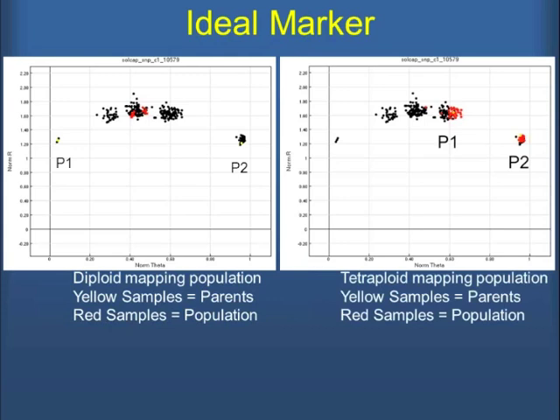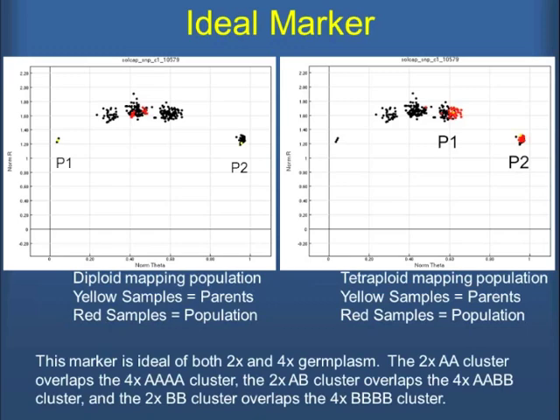So looking at our data here, Candy feels that these are some ideal SNP markers in terms of the way that they're sorting into the different genotypic classes. So you've got to be really careful on handling the data.